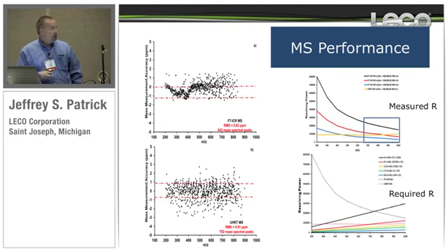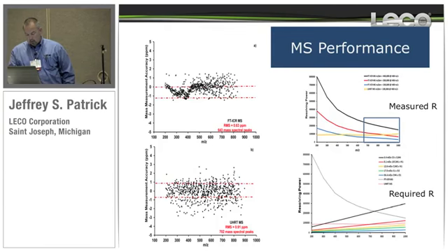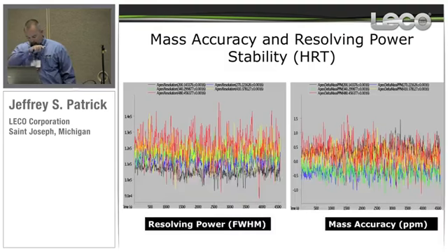From a performance perspective, mass accuracy stability across the M/Z range is approximately less than 1 ppm, RMS 0.63 for the FTMS, and below, the HR TOF has an RMS mass error of 0.91 ppm. Top 600 spectral peaks included and identified for the FTMS, and 700 spectral peaks for the HR TOF. And then, as I mentioned, the resolving power difference, and we'll leverage that throughout this talk.